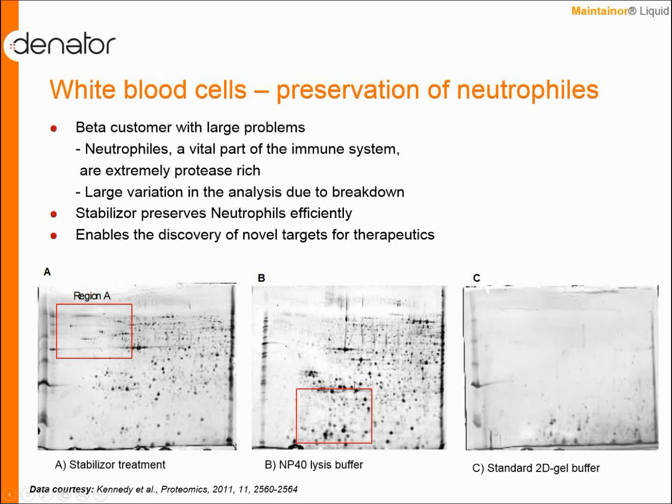There is still quite a lot of things in the low molecular weight, again indicating that there may be degradation going on. In the heat inactivated samples, we see a marked decrease in the number of spots in the lower area, as well as a more defined upper region where we have high molecular weight proteins, which may be a gel artifact, but it may also be an effect of degradation.